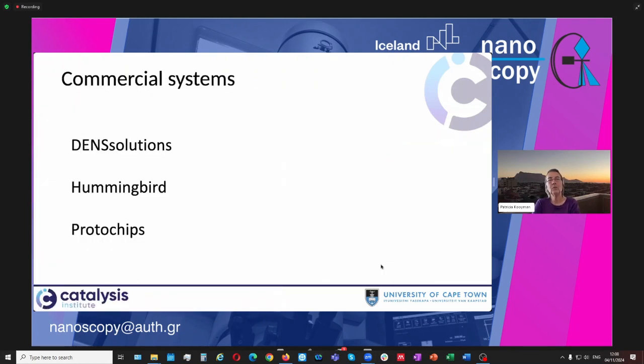So we've mentioned the commercial systems a couple of times. At the moment, there are 3 companies really that make these type of systems, and none of them limit themselves to the gas phase systems, even though that's what I'm speaking on now.